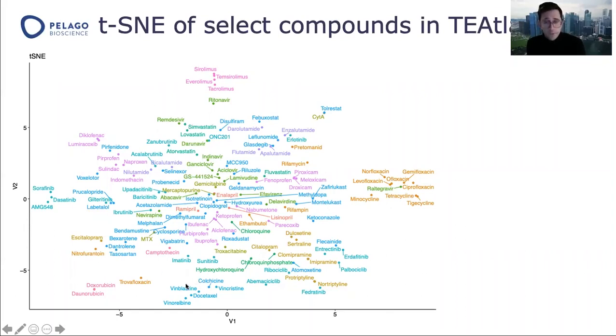Down here, you see tubulin inhibitors, but you can also see colchicine here. This is because colchicine is an alkaloid, and vincristine, vinblastine, and vinorelbine, they are also alkaloids, but vinca alkaloids, so they have that part in common. So that's likely why they stack together. Then you have docetaxel, which has the common theme with the vinca alkaloids, that it binds the tubulins.